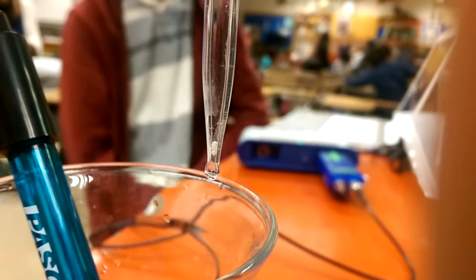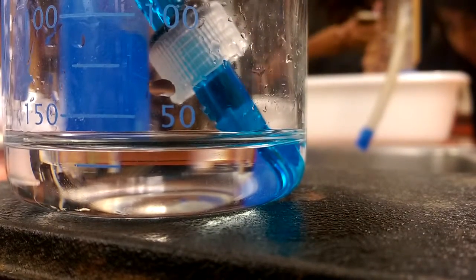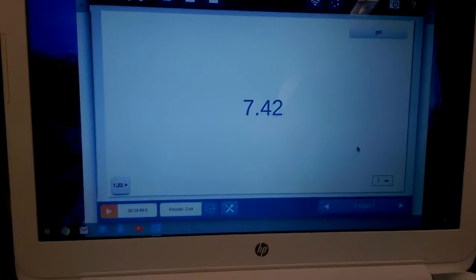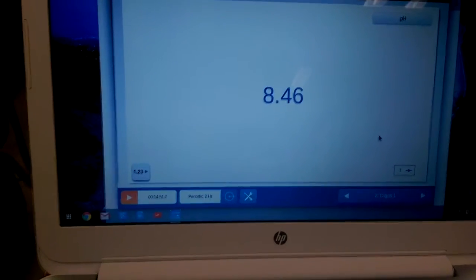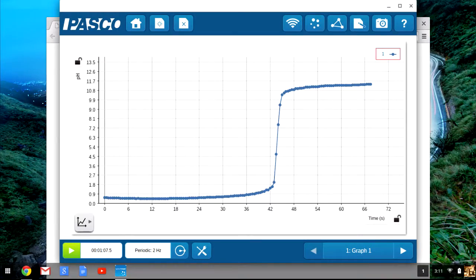Slowly and carefully titrate your analyte by adding drops of titrant. Record your pH of analyte with reasonable and equal intervals. For example, if you're using 10 milliliters of HCl or NaOH depending on your analyte, record your pH at every 1 milliliter titrant added. Graph your recordings using a titration curve, shown here.